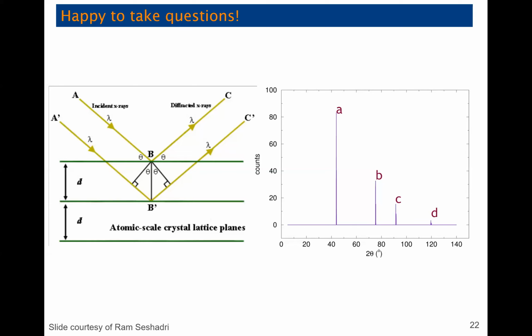I have one more question. Could you touch briefly on the use of in situ XRD with respect to battery science? Sure. We're trying. In situ or operando are both things that you would do while your battery is constructed or operating, and that's very useful for my experiments. Since I work on the electrodes of the battery, we do expect that the structure changes as you put lithium in and take it out.